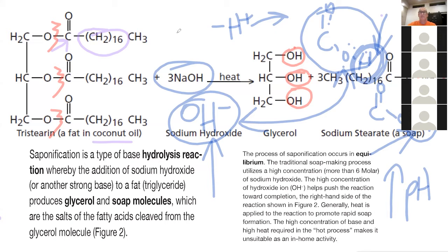So if you have a weak acid, like a carboxylic acid, basically any acid with a carboxylic acid group, they're all weak. And the length of the carbon chain really doesn't have anything to do with how strong or weak the acid is. They're all pretty much the same. And so just like acetic acid, like we did with the titration, when we added strong base to that weak acid, it deprotonated it. It pulled that hydrogen off of it and made water. What we were left with was the conjugate base. We were left with acetate, and we get exactly the same thing here.